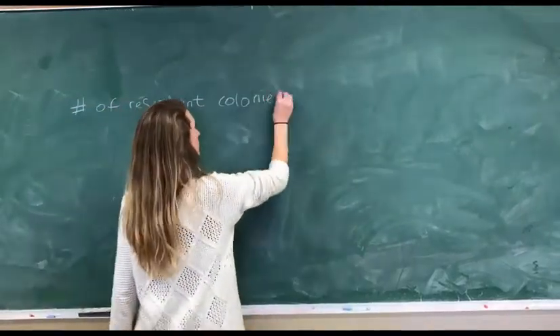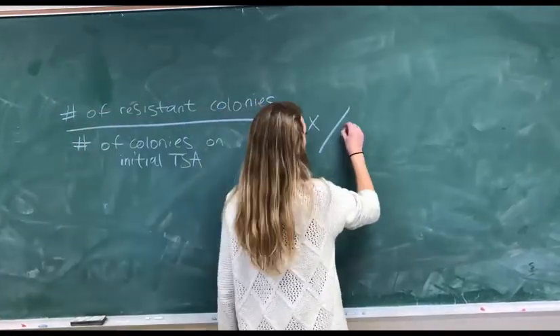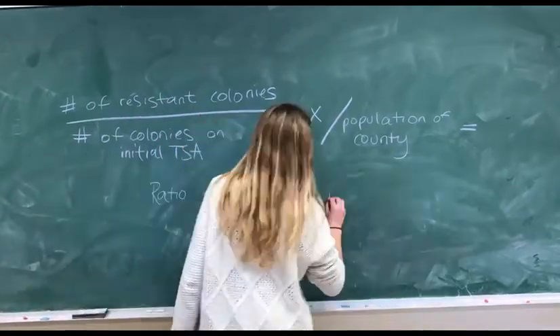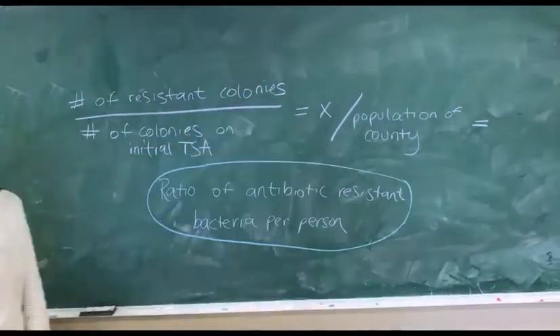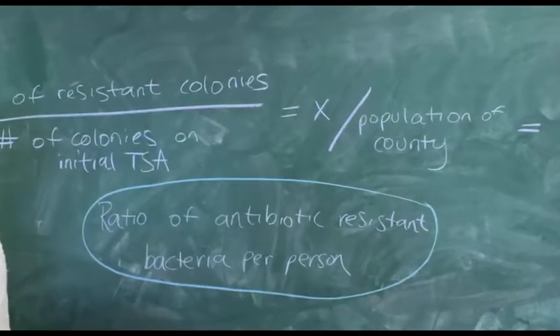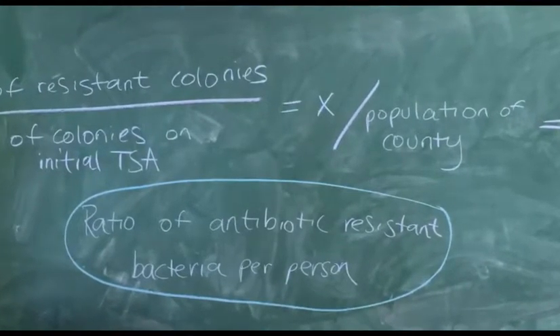So far, we have analyzed the number of colonies on the plates containing antibiotics and compared them to the growth on the non-selective media. We have taken this ratio and once again compared it to the population of the county it came from. So far, this preliminary data shows that there is comparatively more antibiotic resistance from counties that do not participate in the Wyoming Medication Donation Program.